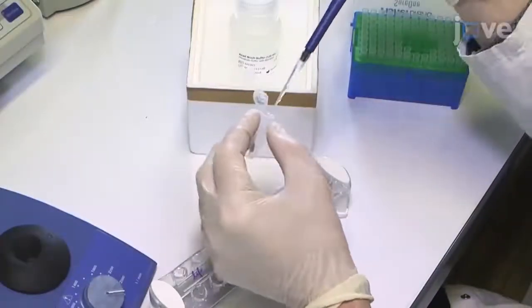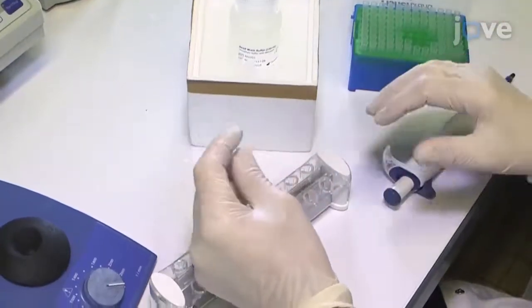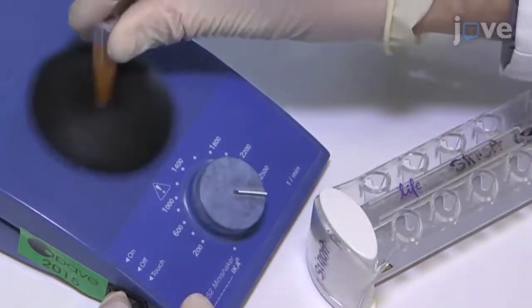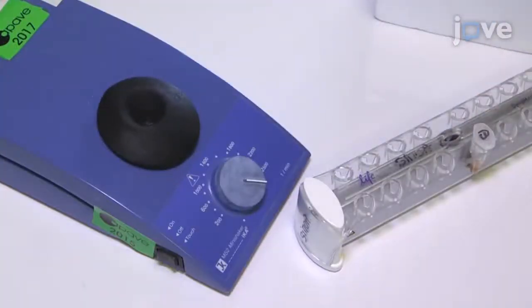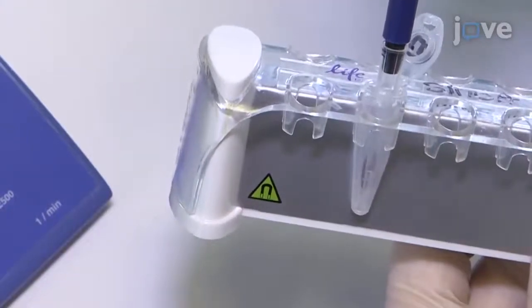Next, wash the beads with BWB twice and BCB twice. For each wash, add 200 µL and vortex the tube for 5 seconds. Then separate the beads from the solution using the magnetic separator. After one minute of separation, discard the diluent.